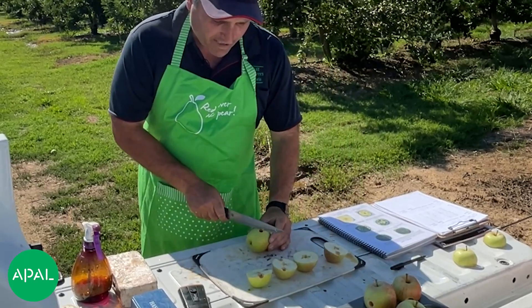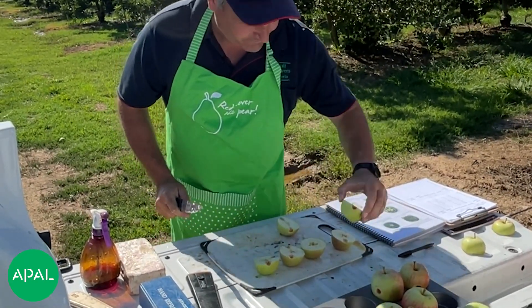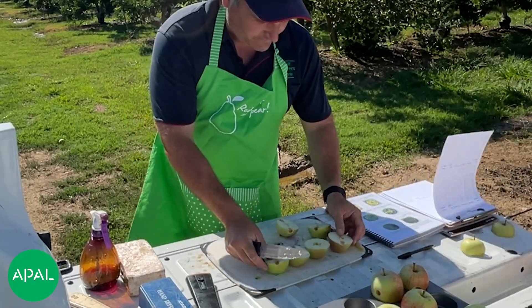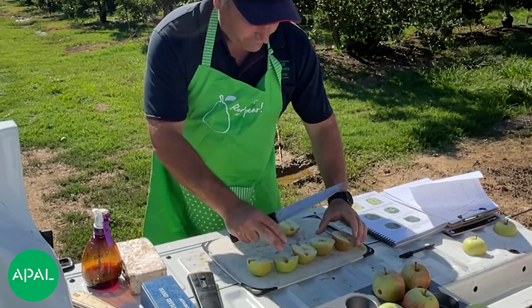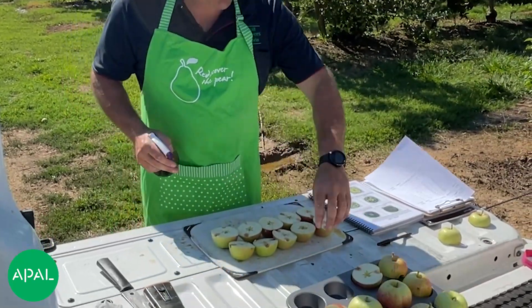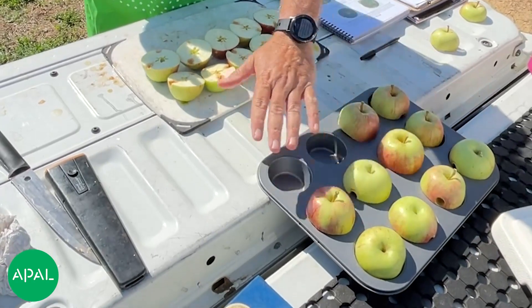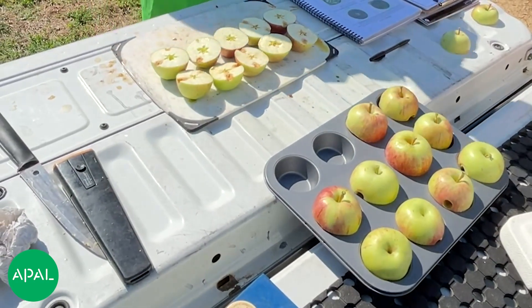To get the fruit ready for the starch test, I tend to keep the bottom half, though some people will want to keep the top if they want to do an assessment on colour as well. Once they're laid out, that's also a good opportunity to give an idea of the fruit's colour.